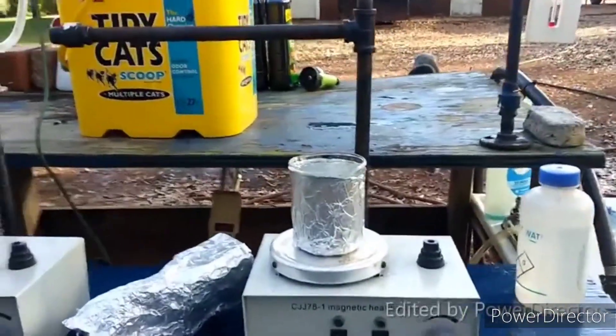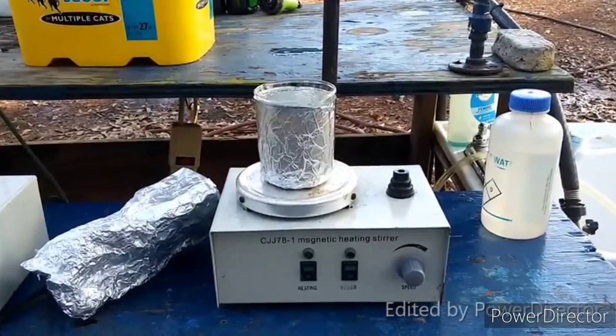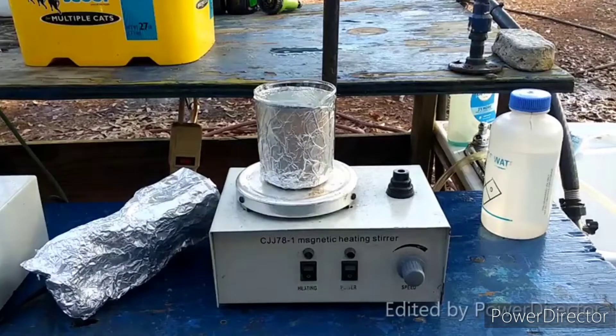I am just going to transfer this. The textbook says to evaporate it over on a boiling water bath. Now we are supposed to heat this up and evaporate it down until we get to a point of crystallization. I will come back when that happens.